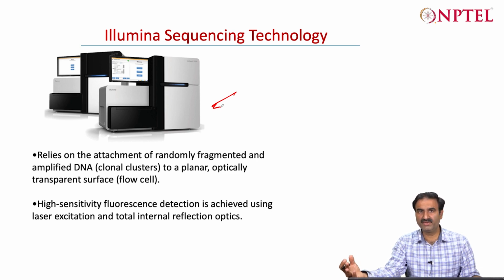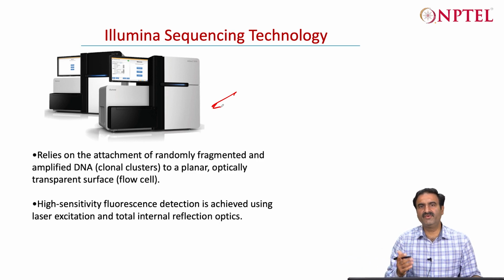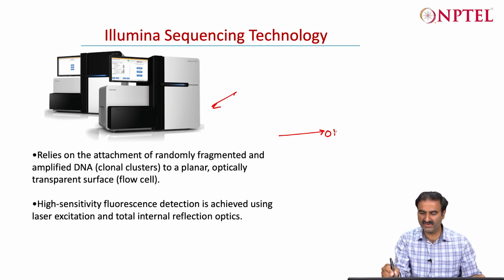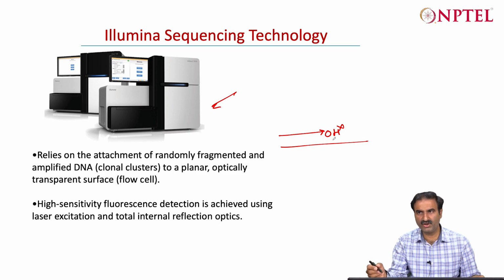In the Sanger, if you remember, we used to have 4 normal nucleotides and 1 nucleotide with dideoxy. Here also that nucleotide has a blocker at the OH group, but that blocker is reversible. So you can always remove that blocker and continue with the sequencing. That blocker can get inserted into the DNA, and a free OH end is needed, so if you have a blocker here, the sequencing will pause and the chain of DNA will not be extended further.